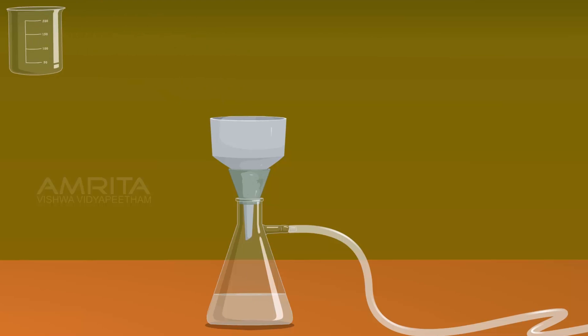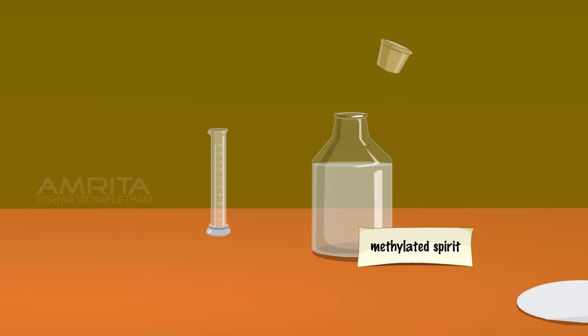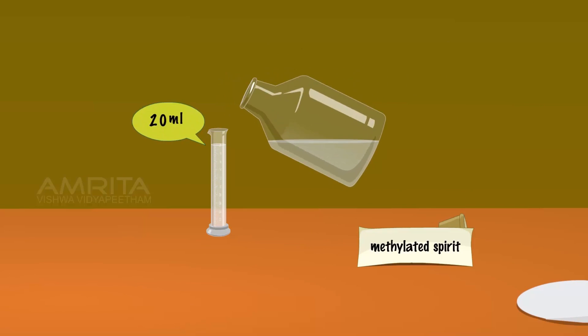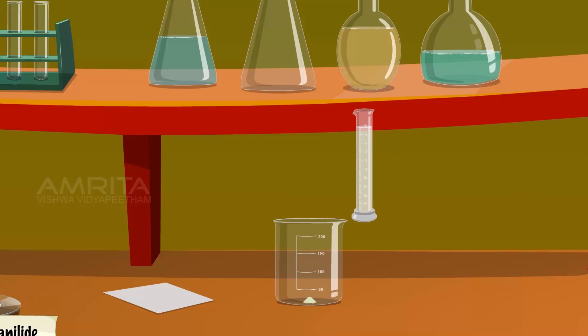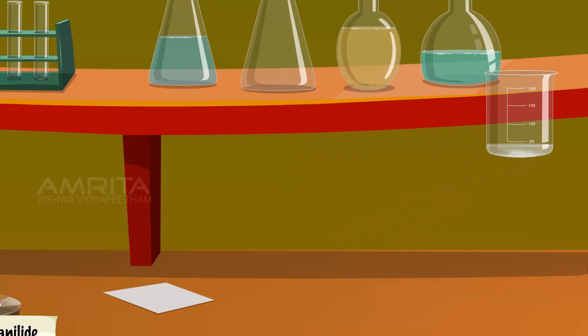Take the precipitate from the funnel using a spatula and transfer it into a beaker. Take 20 ml of methylated spirit and pour it into the beaker containing the precipitate. Stir it well using a glass rod to dissolve the precipitate, then warm the liquid to get a clear solution.